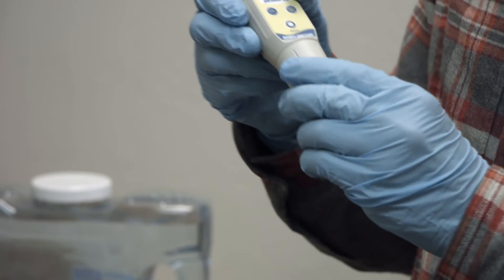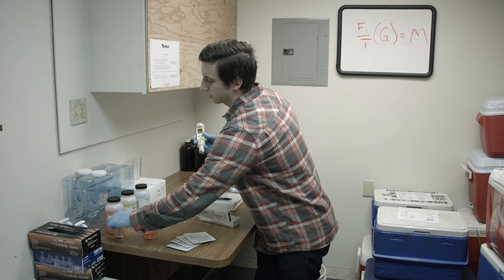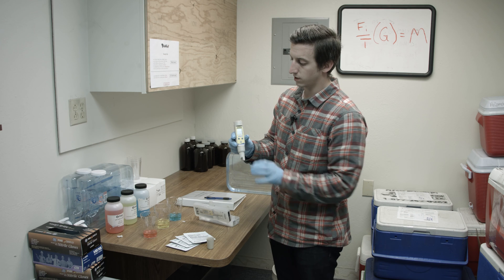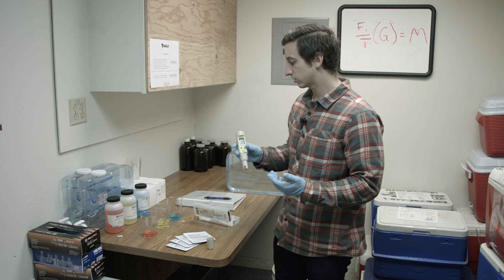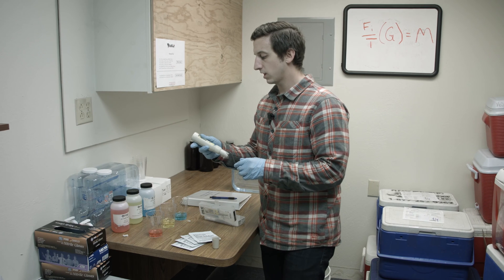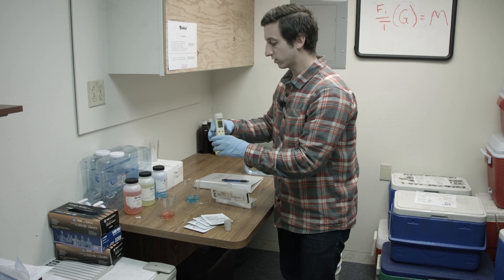Now let's start our three-point calibration. The first thing I'm going to do is take off my cap carefully, and it's a good idea to take out the cloth inside so you'll remember not to store it with the old one. Now we press the on button — this device is nice and simple because there are only three buttons. Before using it you can rinse it off, give it a little shake, and now we're going to enter calibration mode by pressing the CAL button and dropping it in the pH 7 buffer solution.